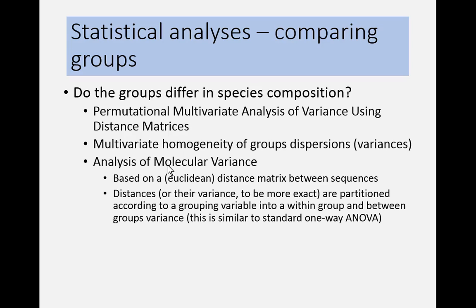And basically, they are testing exactly the same thing: do the groups that you have specified in Chipster in the group column, or in general in some other variable, somehow differ? They use slightly different methodology for calculating, for example, the p-values and the actual tests, which explains why they might give slightly different results.